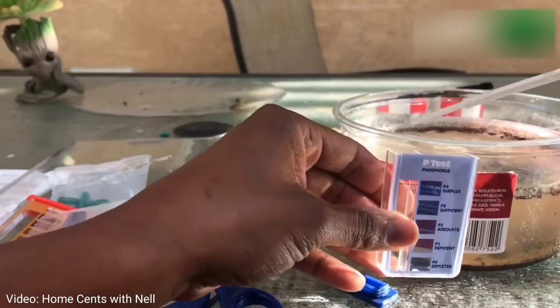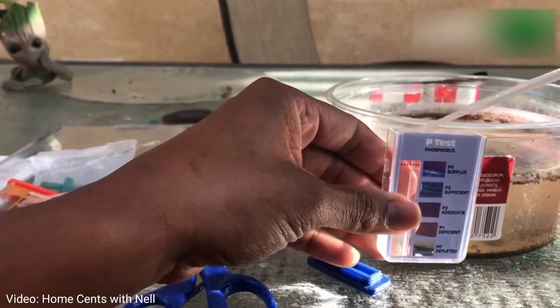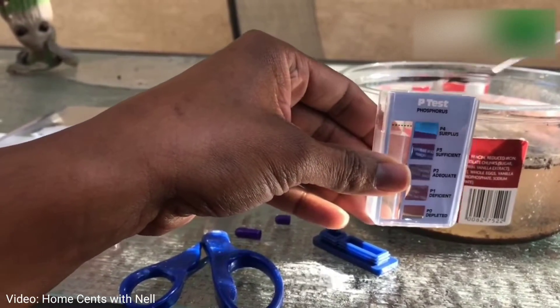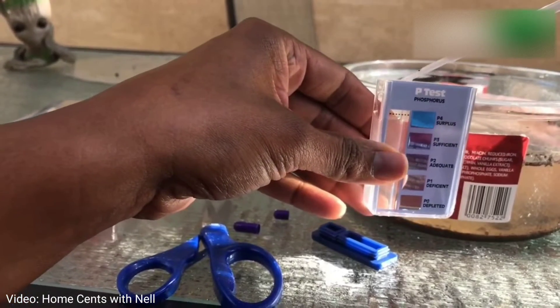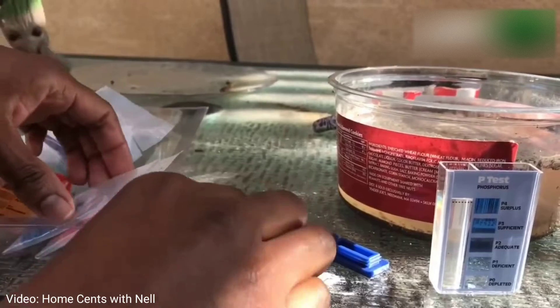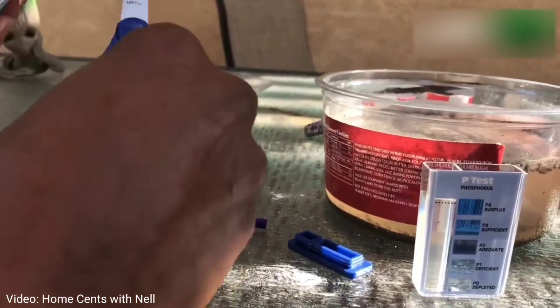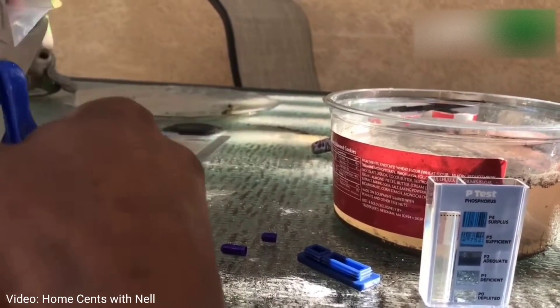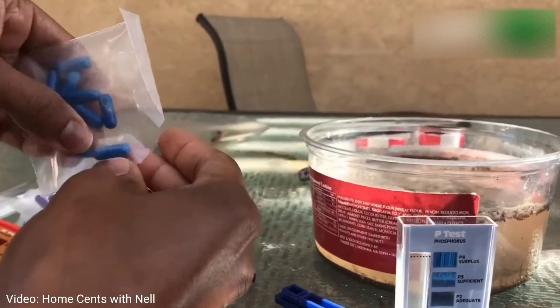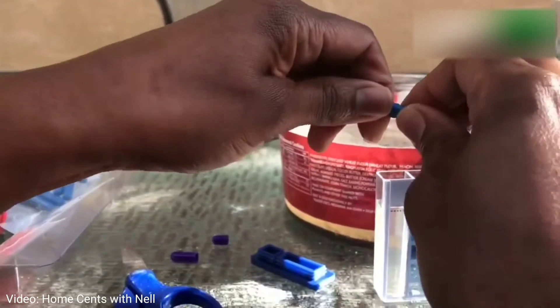The phosphorus, or P test, is done the same way — you simply take some of your water, fill it into the chamber, and add the contents of the blue capsule. Shake it and let it sit for 10 minutes. Phosphorus is also very important for our garden because it allows plants to form new tissues and they need it during the process of cell division, so it's really important that we are aware of what levels of phosphorus are in our soil.